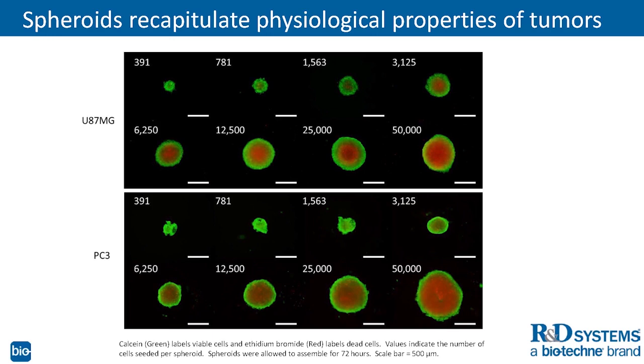nutrients to maintain viability. And I think I forgot to mention that what we used here was calcein AM as our viability reagent. What happens is the cells internalize the calcein AM, and it is metabolically converted to calcein, which fluoresces and is trapped within the cells. And the red staining that we see in our dead cells is ethidium bromide.